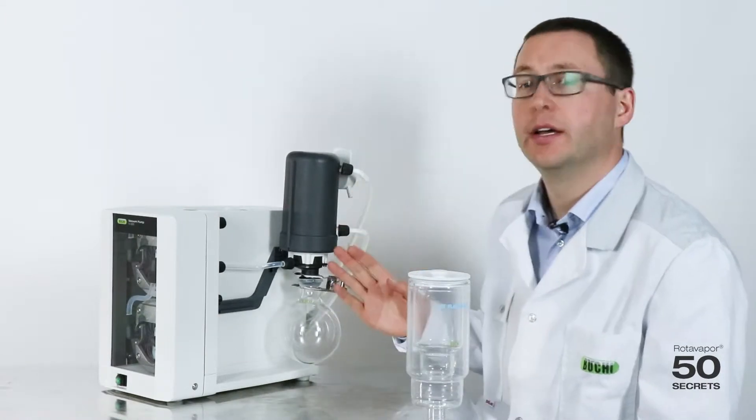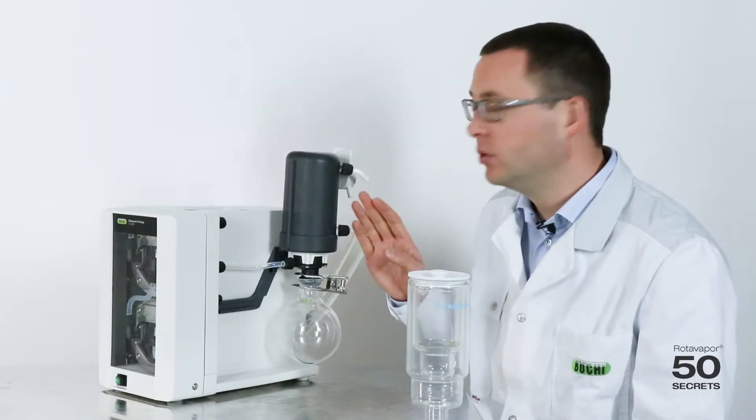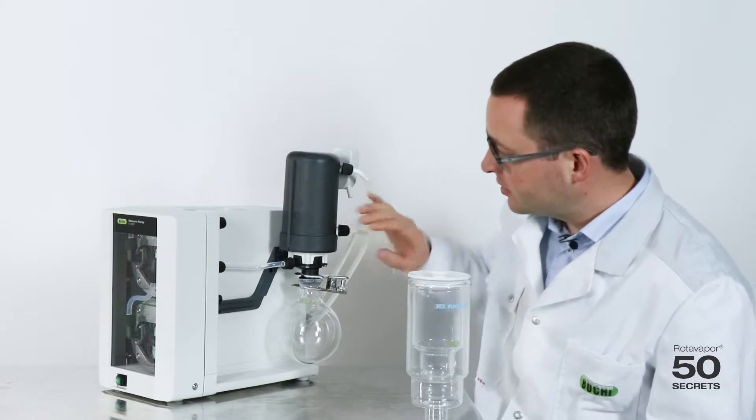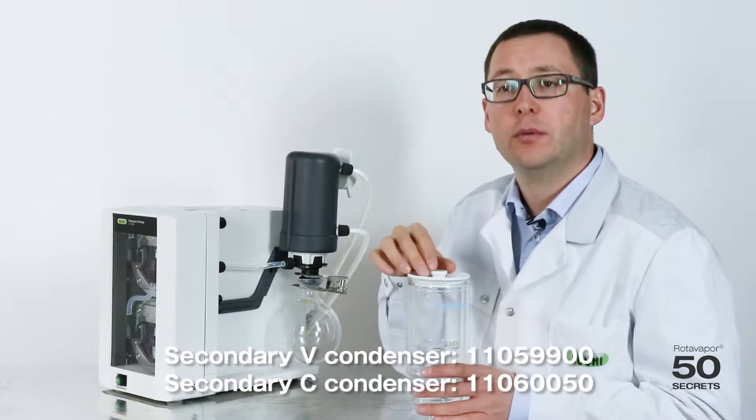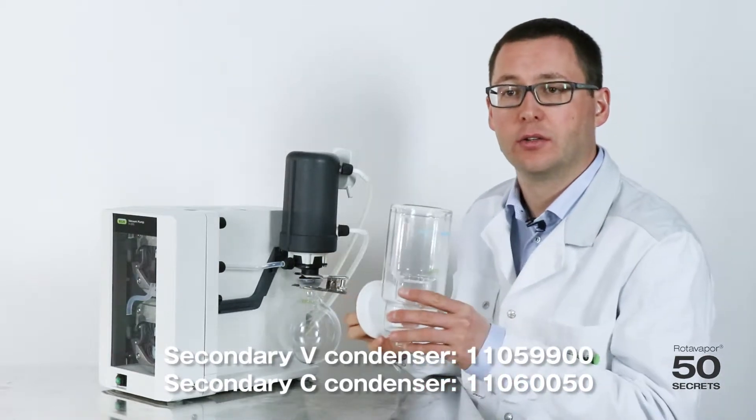Today's secret is about the secondary condenser. We have two different ones. One is the V condenser, which is this one, which has coils inside, and this one, which we call the C secondary condenser.